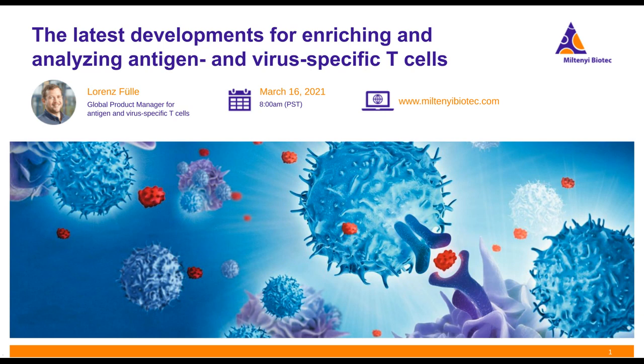Thank you. Have you tried to culture enriched activated T cells? Yes, this is what we are currently actively working on, and we will hopefully very soon release protocols, especially for the cultivation of enriched activated T cells. But of course, I think in the slide deck there is already one protocol for the expansion of antigen-specific T cells before stimulation, if I'm not mistaken, but I would have to look that up. I'm very happy to come back to you on a different occasion.